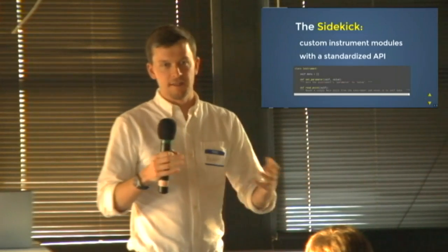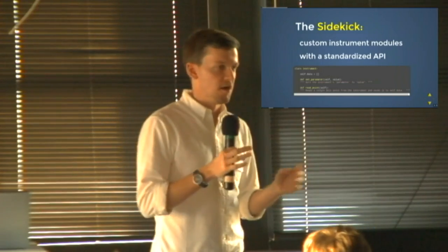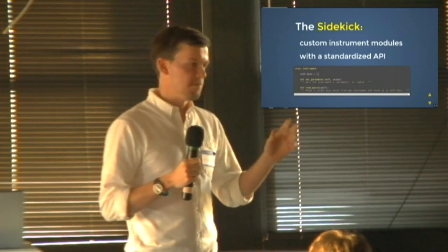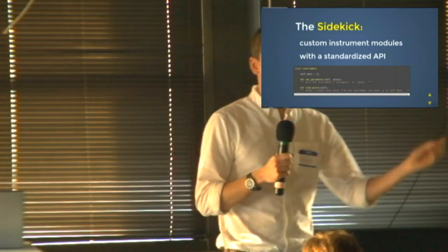Fortunately, the Python ecosystem is well enough developed that even in this case, a lot of the work was done for us. We have instruments that communicate over a couple different types of interfaces. There's some TCP ones, a couple different types of serial interfaces. But fortunately, there are already Python modules that talk over all of these interfaces. So all we had to do was go in the manual, look up what kind of commands the instrument was expecting, and then just write a little Python wrapper that sent those commands.